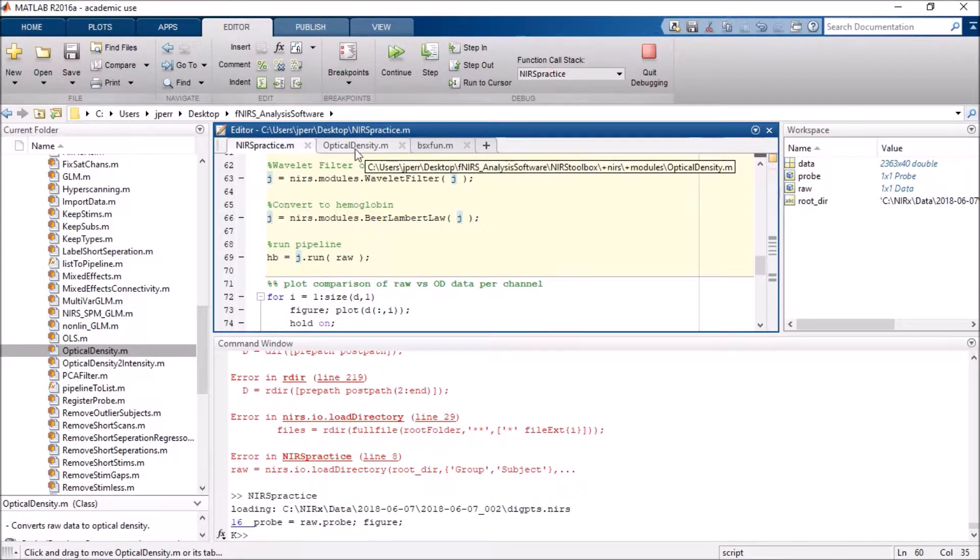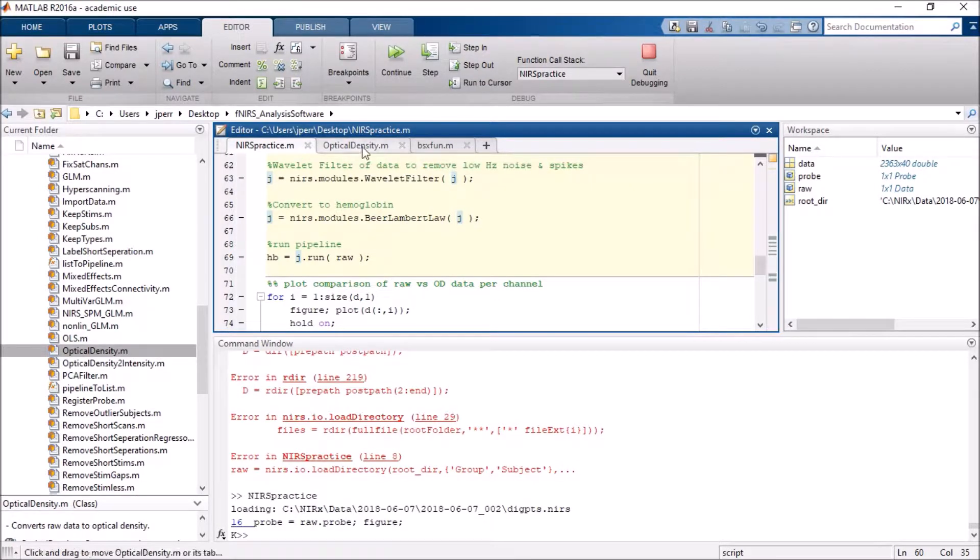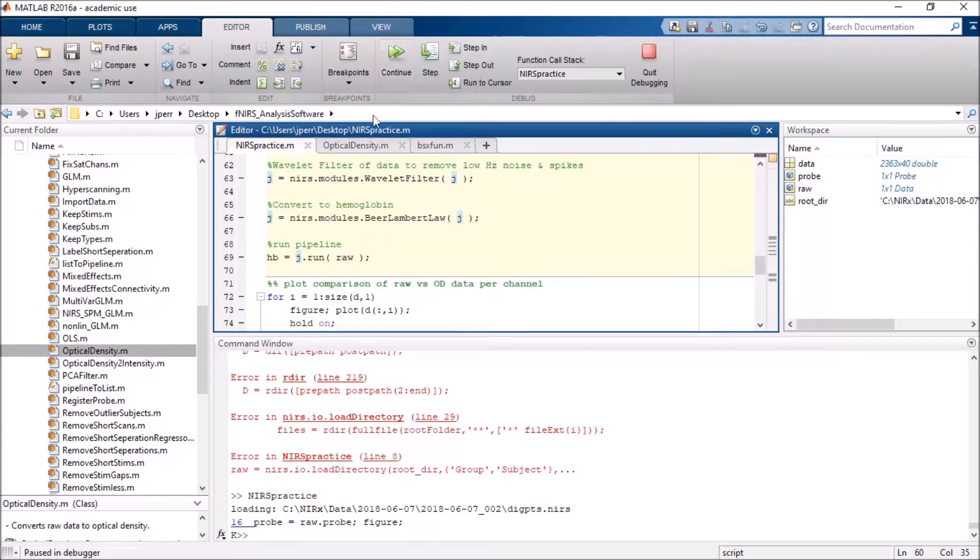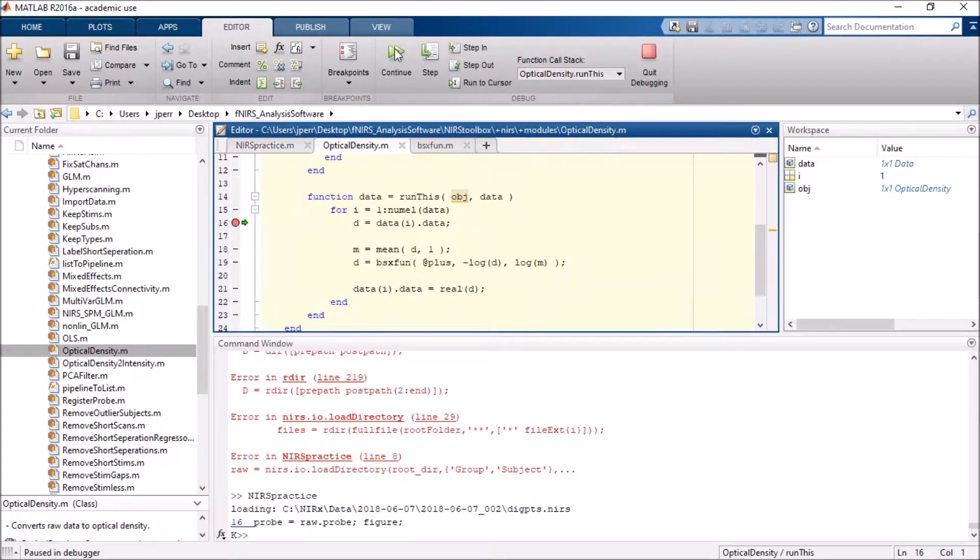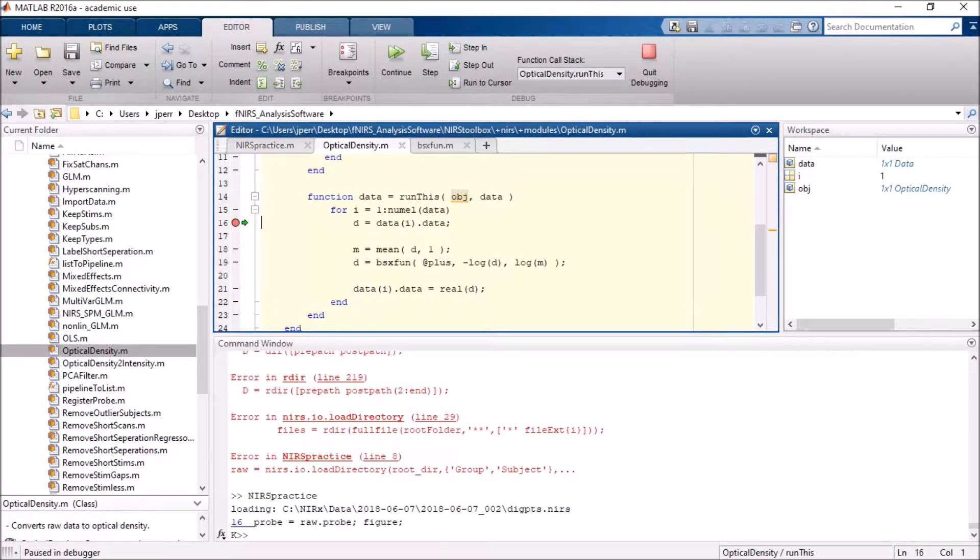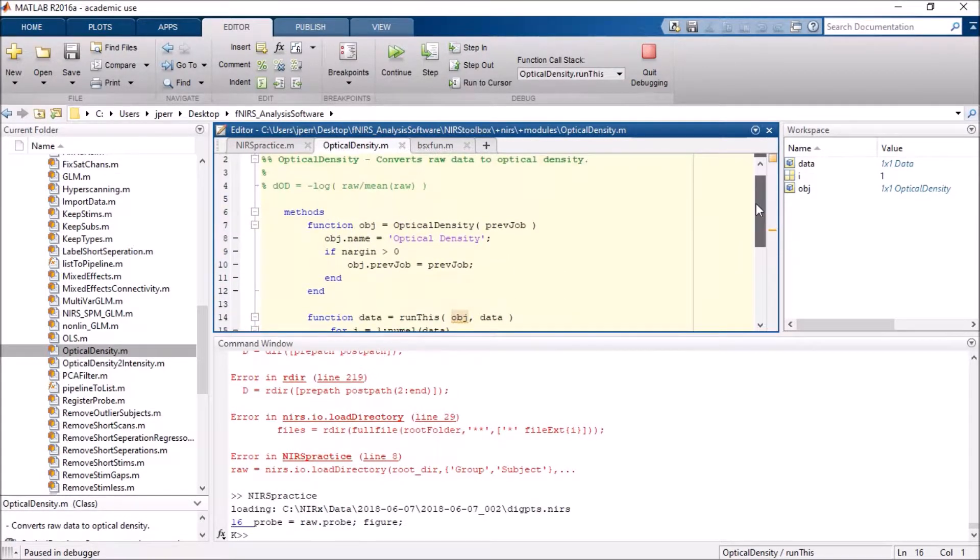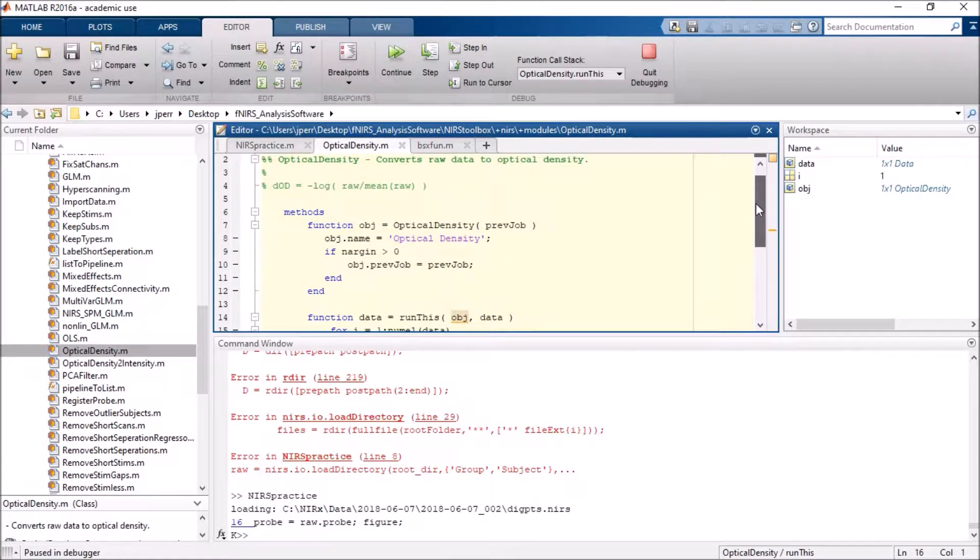I'm going to focus here on the optical density function. So once I actually go forward here, I should actually have a stop point here. So when I actually run the optical density, first off there's the method up above.